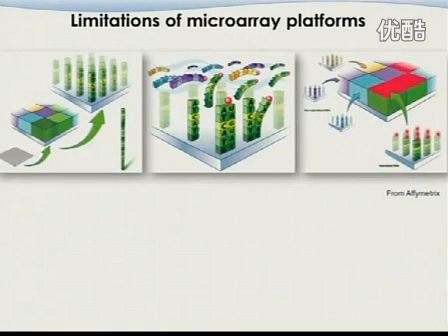After that, you take a very fine image of the entire thing, and count how many red hats are collected in each individual compartment. The higher the expression level of that particular gene, the more signal you will be able to detect. That is the basic principle.